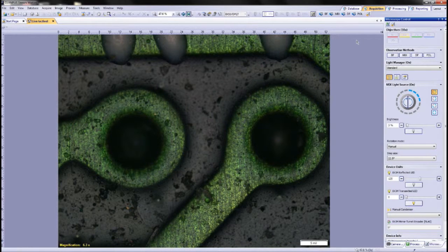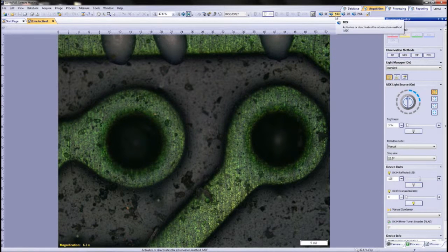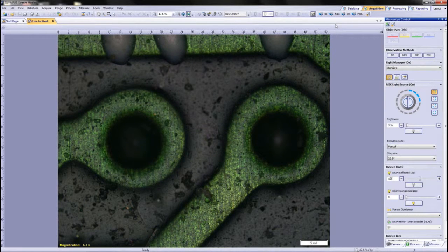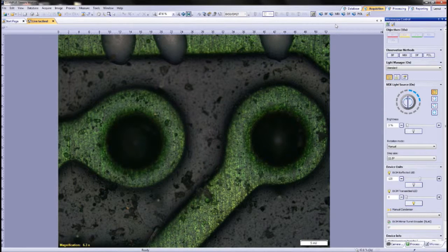We're looking at a PC board here — something basic — to demonstrate different observation methods: bright field, dark field, polarization. One of the key new features just launched is the mix mode feature. When we run mix, it uses a quadrant LED light source and allows us to mix dark field and quadrant lighting with bright field imaging, polarized light imaging, and even fluorescence imaging, giving us many more lighting and contrasting techniques.